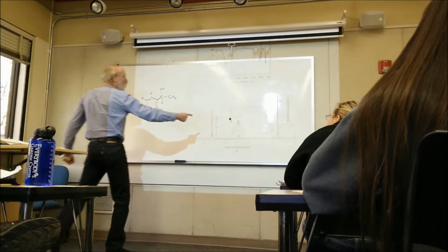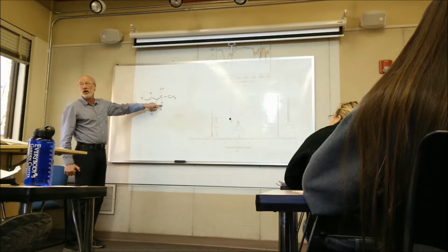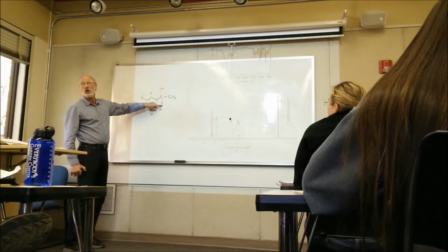Okay, so one of these we're looking at is this, and the other is that, because they each integrate to 1. Which one is which, though? Well, where do alcohols resonate?